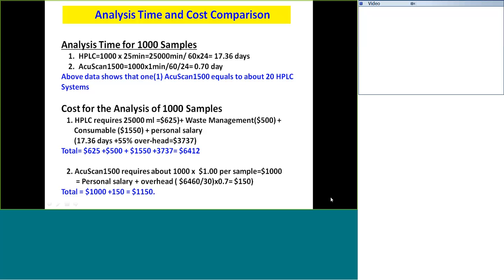For example, in Taiwan right now, we work with a company that sells imported oil from Argentina, Brazil and India, say sunflower oil. The sunflower company will send them a sample to test, and of course that sample is tested with HPLC. But if you test with Raman, the system we have, which is what they're using today, they get a spectrum of the sample and store it in a library. So when the truck comes in from the company in Argentina to Taiwan, before they unload the 50-gallon cans, maybe 100 of them, they test it in a couple of minutes.